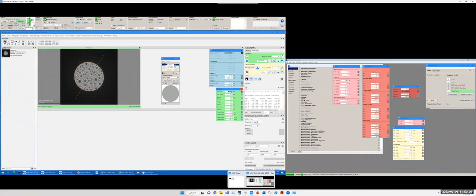So we can finally confirm by typing zero and seeing the liquid-like feature on this Ronchigram. Yeah, you can see that there is still some astigmatism showing as line features. So you can give it a hand tuning with a very tiny step size. I want to change this one also. Okay, somewhere here. Now let's do a final measurement after hand tuning, measure.